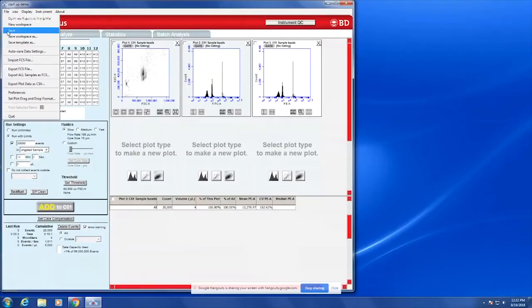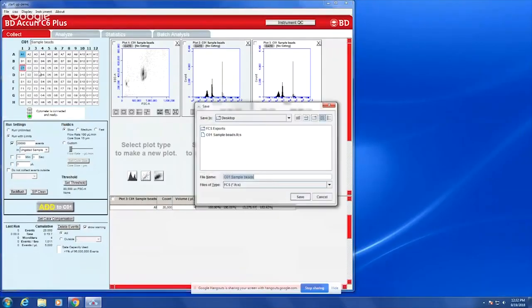Exporting files include several formats. Workspaces and templates can only be read using the same software and equipment. Templates are useful to share between lab members who run the same types and analyses. FCS files can be imported into most flow cytometry analysis programs.